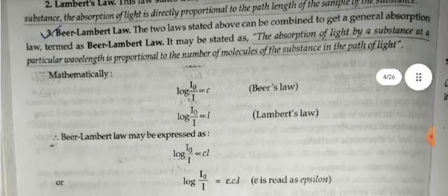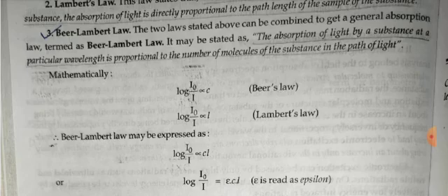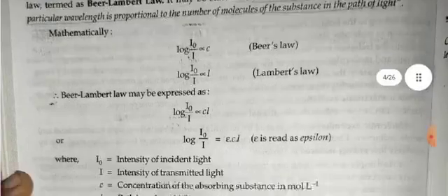Third law is Beer-Lambert's law. The two laws stated above can be combined to get a general absorption law termed as Beer-Lambert's law. It may be stated that the absorption of light by a substance at a particular wavelength is proportional to the number of molecules of the substance in the path.